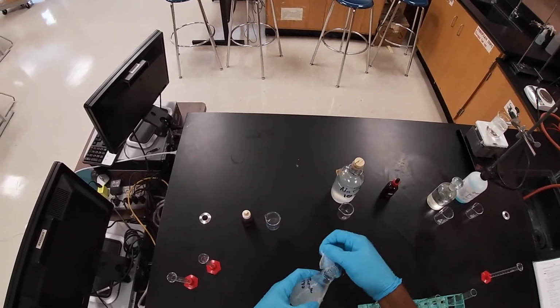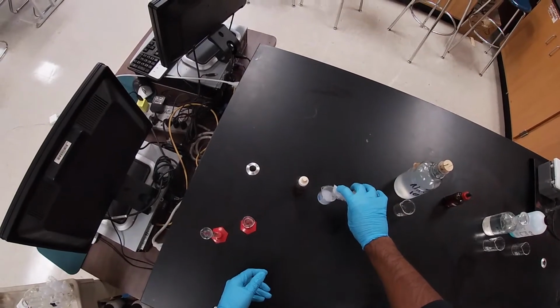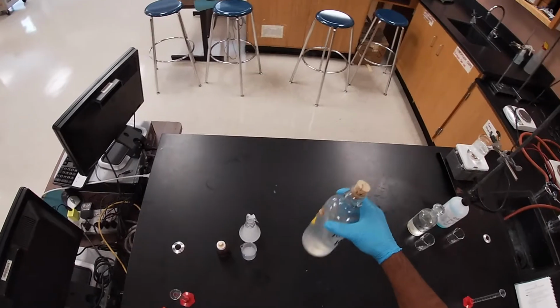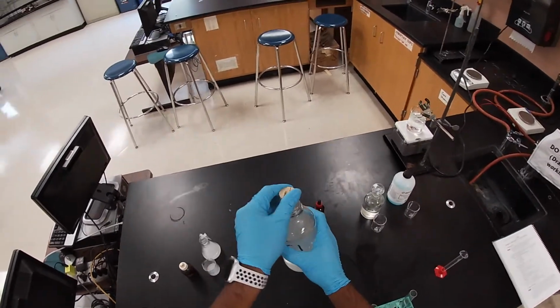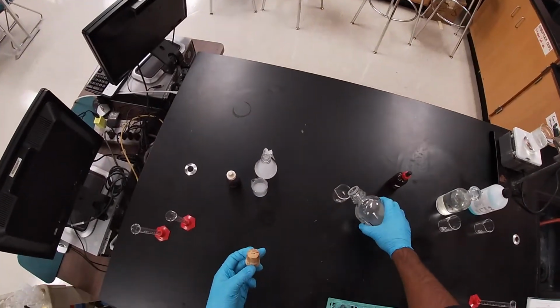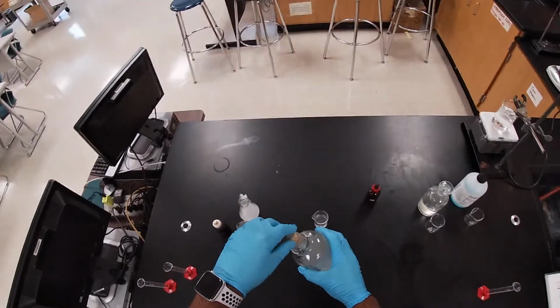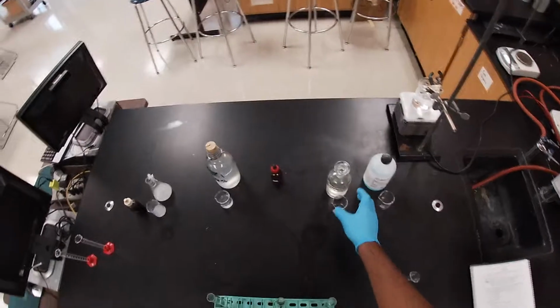And so the first thing that I'm going to do is I'm going to go ahead and get my starch solution, and I'm going to add a little bit to my beaker, and then again I'm going to get my sodium chloride solution, and I'm going to put it in a beaker here. I don't want to mess up the stock solution, so that's why I have a beaker with each of those.